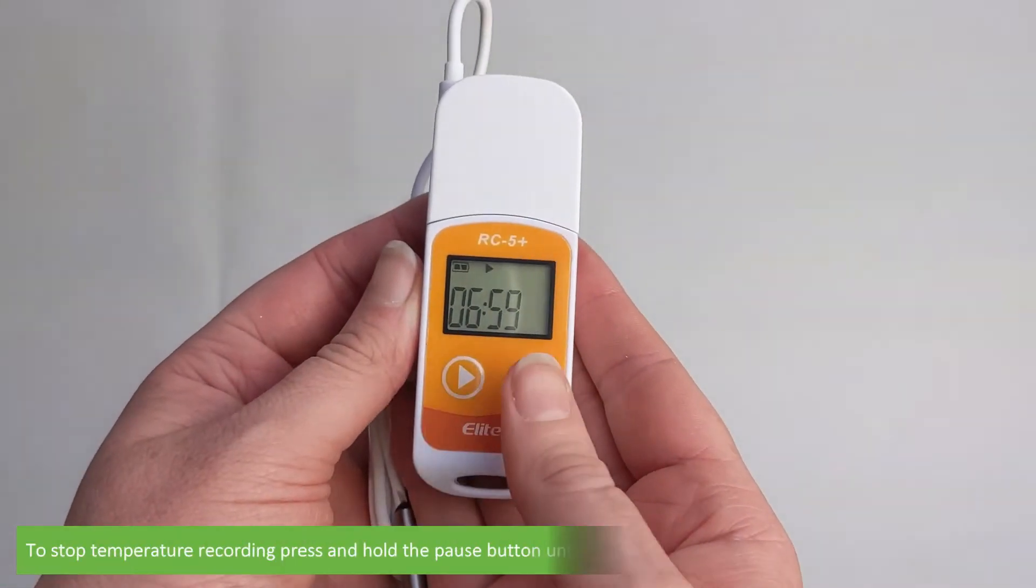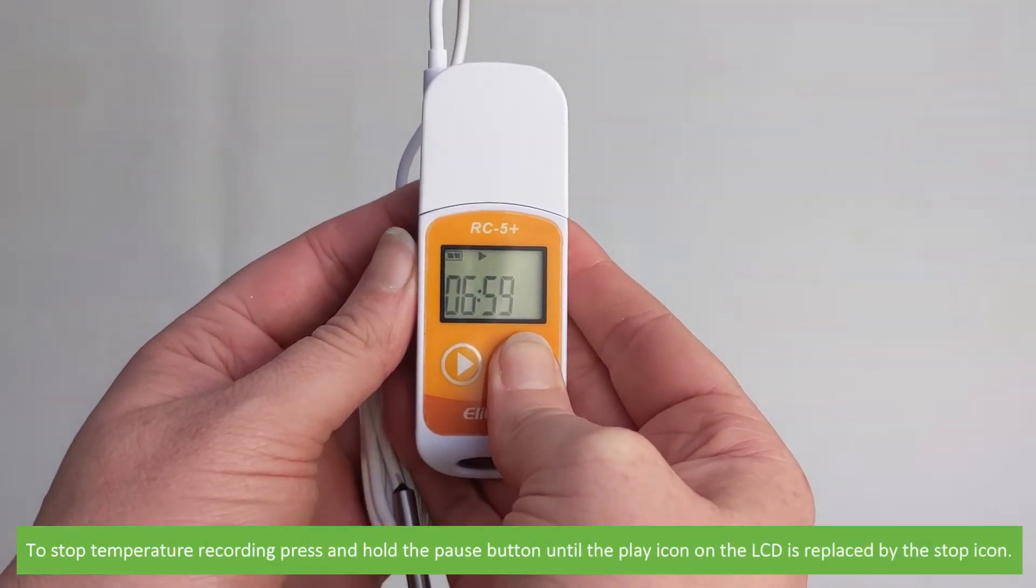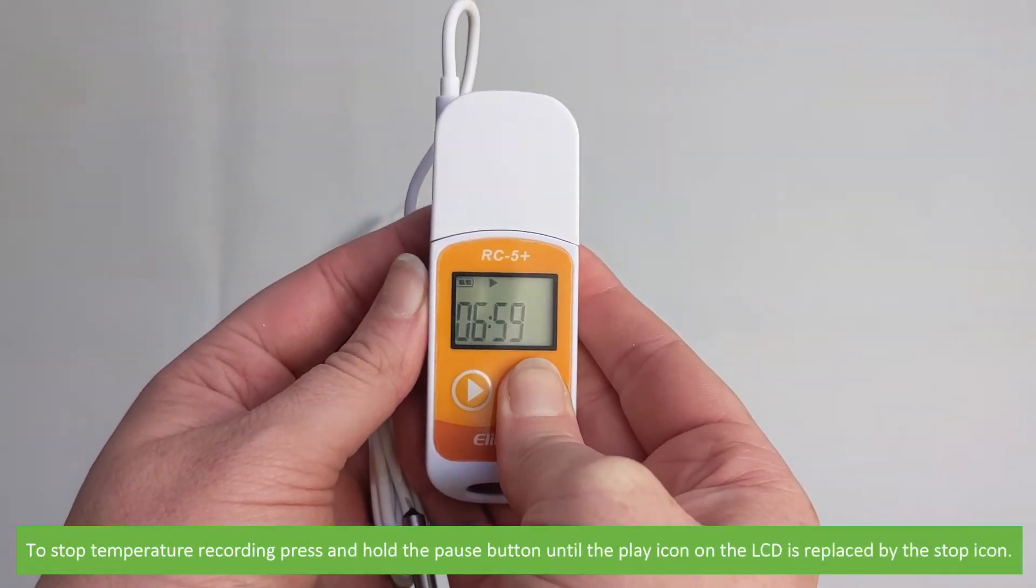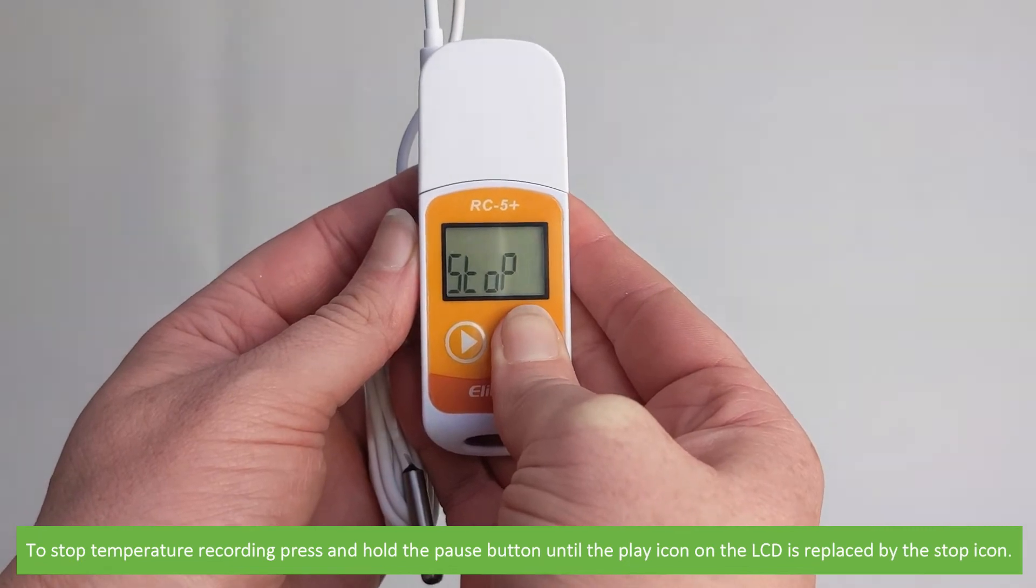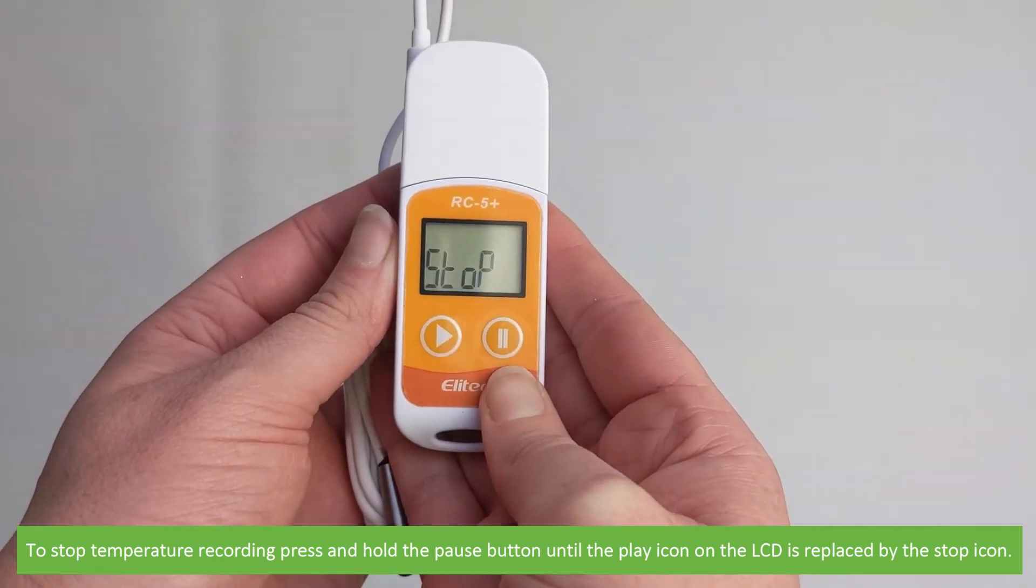To stop temperature recording, press and hold the pause button until the play icon on the LCD is replaced by the stop icon.